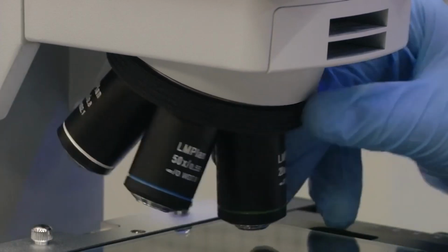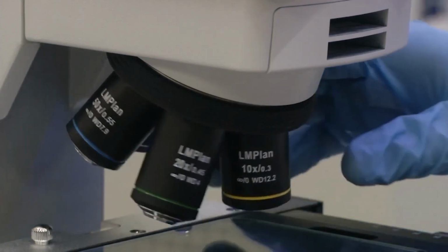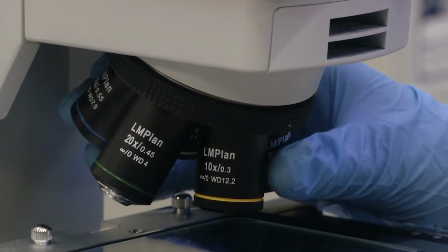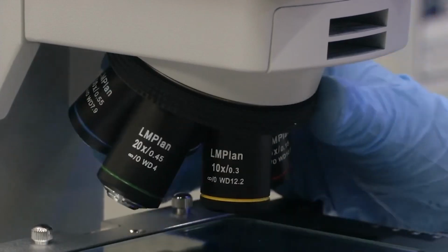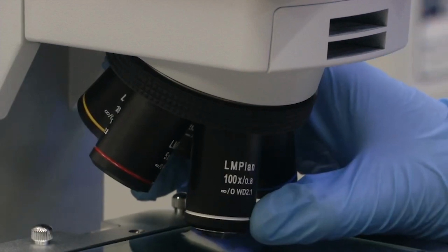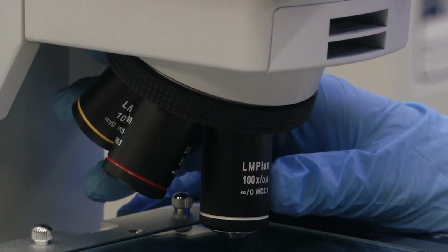So let me recap. We have this turret which houses all the objective lenses used by the microscope. You can have multiple options, and usually a turret gives at least 5 slots to insert your different objectives. Here in our lab we have inserted 5x, which is red in color, 10x, which is yellow, 20x, which is green, 50x, which is blue, and 100x, which is white. These colors are only for your easy use during your day to day research life. You need not go and read each lens to see the magnification.